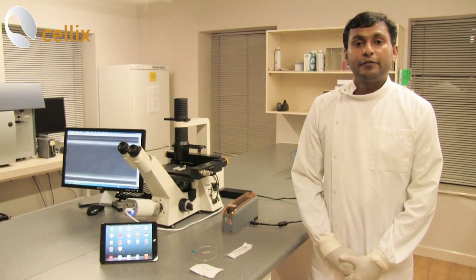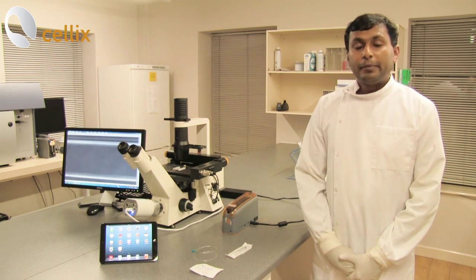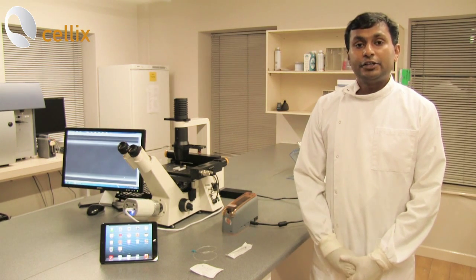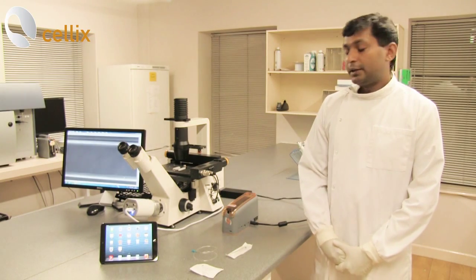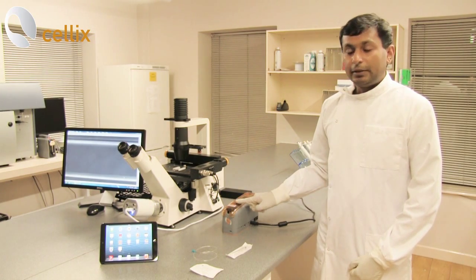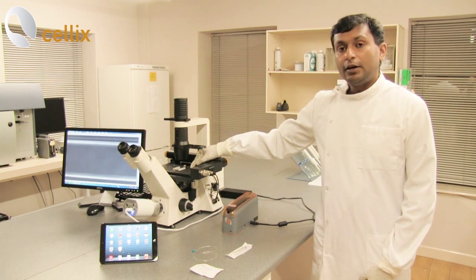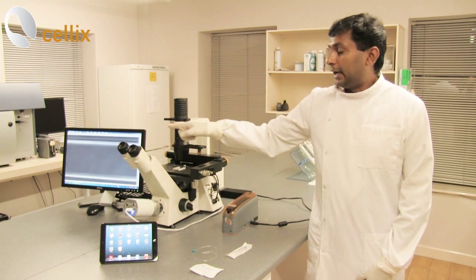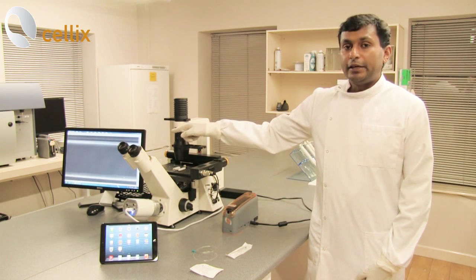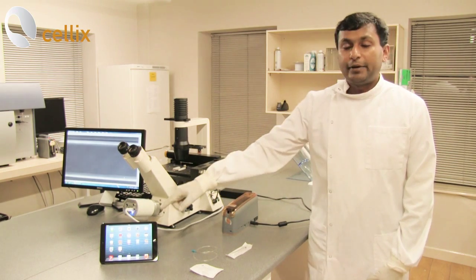In this session we are going to demonstrate the application of the Execo microfluidic pump for cell adhesion and rolling experiments. For these experiments we are using only one Execo pump, a Vinayate Fluoroplus biochip fitted on the frame of the microscope, a camera connected to the microscope, and on the screen you can see the live image of the channel. The pump is controlled by iPad mini.